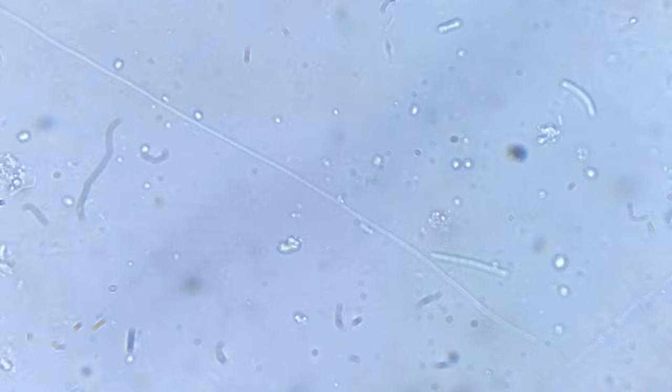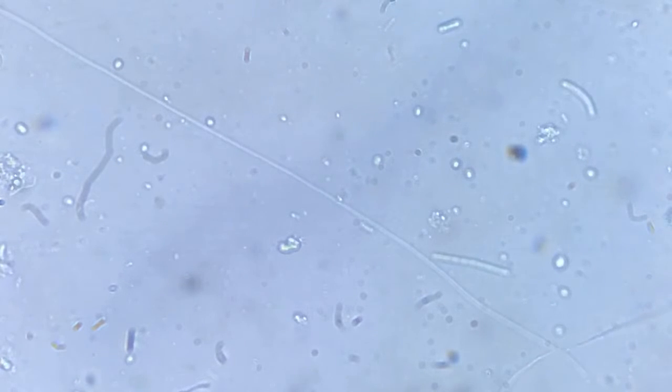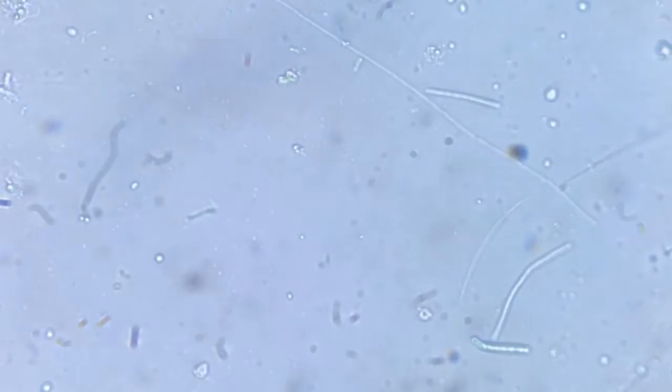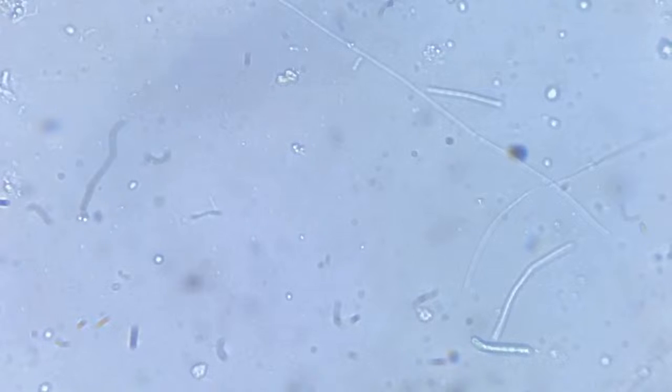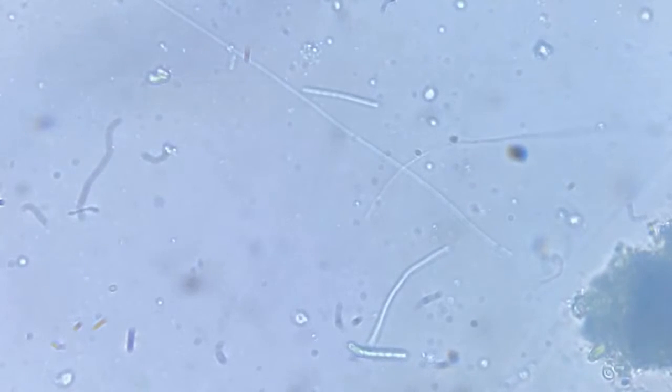What is more interesting is that they prefer moving in a straight line. Then there's another one at the bottom. Here they are crossing each other.